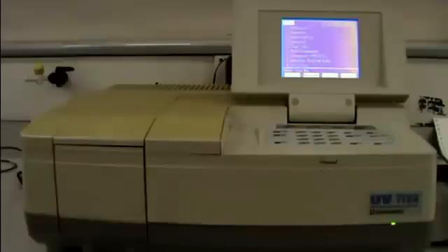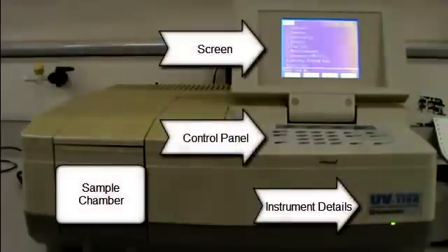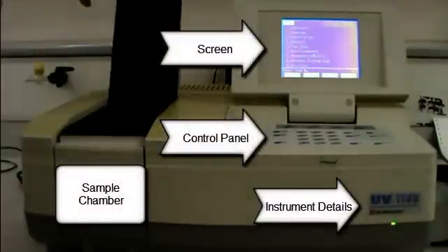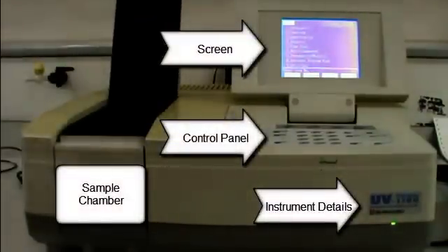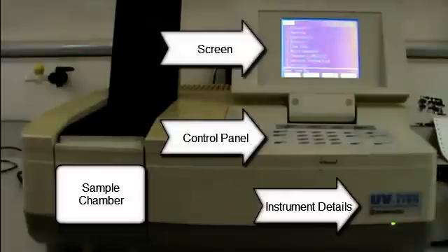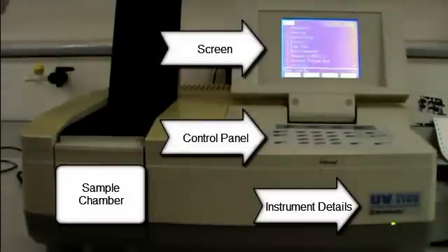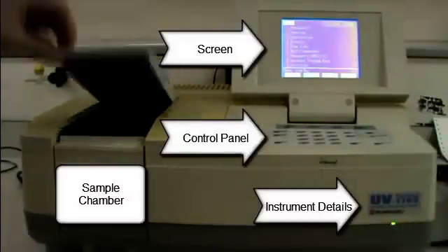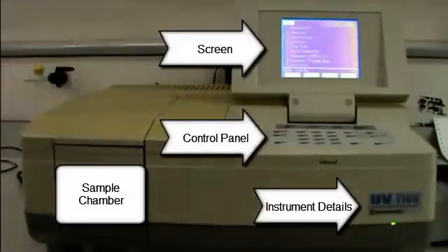This is a typical UV visible spectrometer. There is a sample chamber where we place the reference and sample cells, a control panel on the screen. When obtaining a spectrum you should always record the instrument details in your lab book.